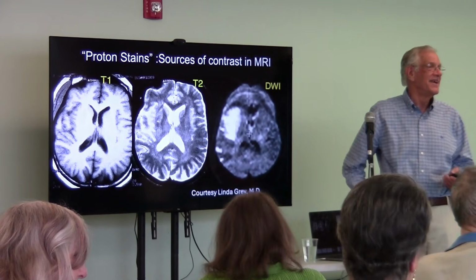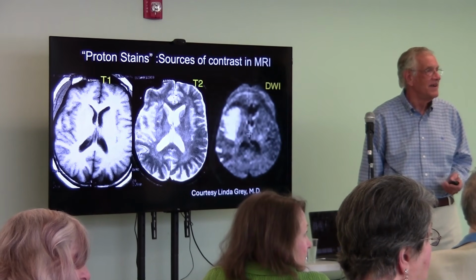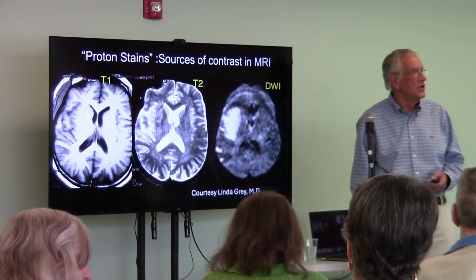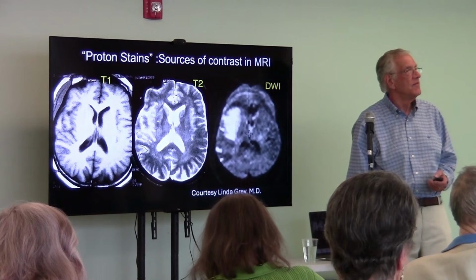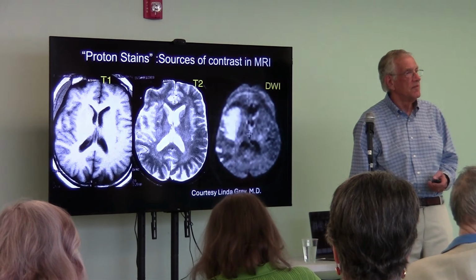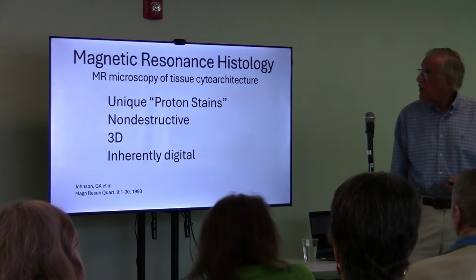Yes, Jennifer. So just to back up for a second, as far as the measuring proton, basically electrical activity. You're not measuring that, you're measuring the magnetic interaction. Correct. So why proton? Is it the size, is it the charge of protons as opposed to, say, electrons or others? Oh, did you already go over this?